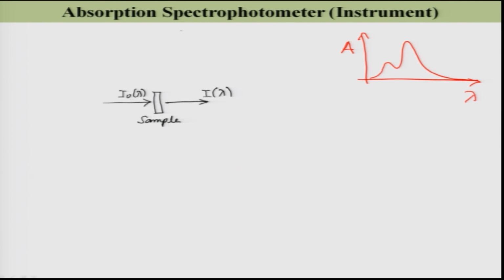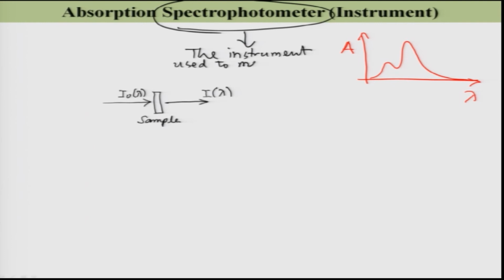So, the spectrophotometer, again, is the instrument used to measure the absorption spectrum, right.